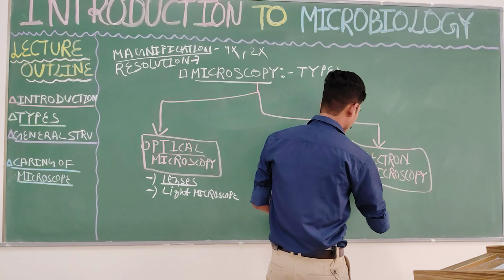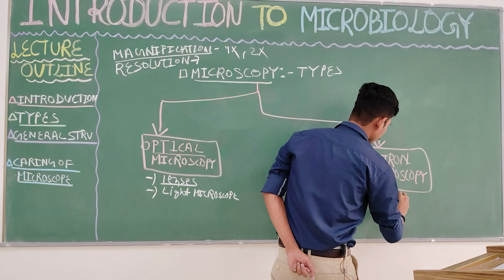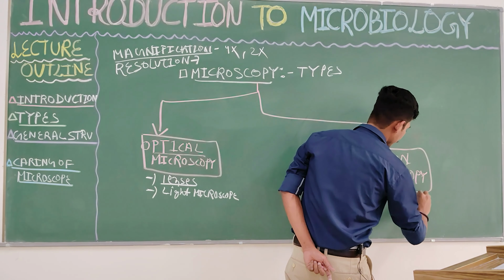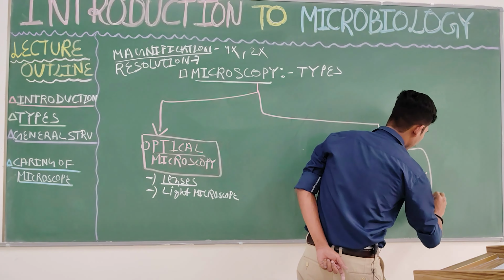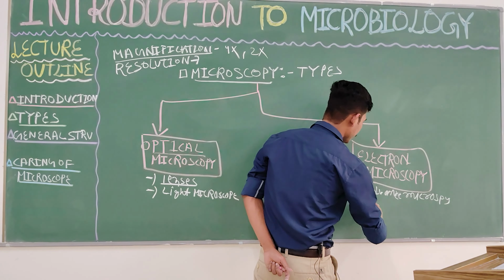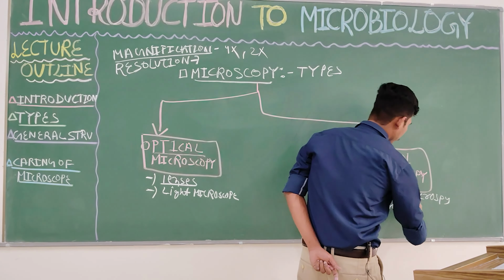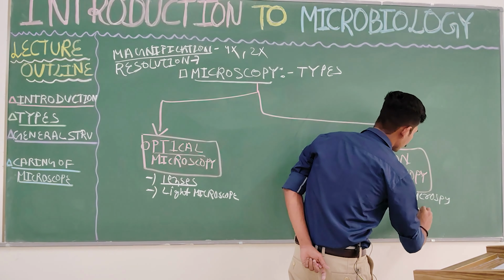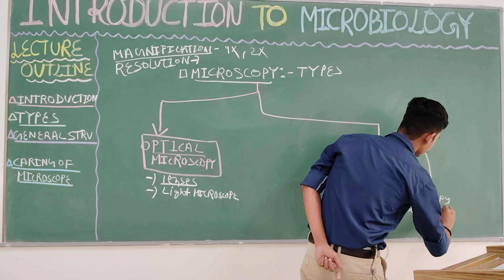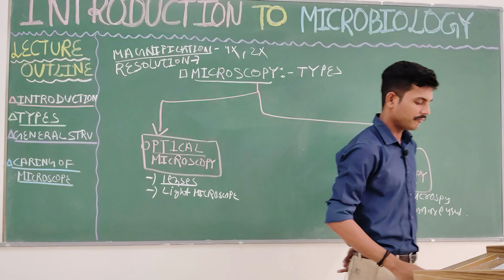First, it is an advanced type of microscopy. Another thing is that electron beams are used in order to generate the three-dimensional view.